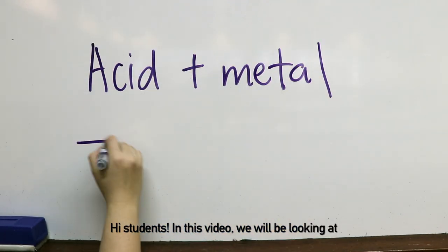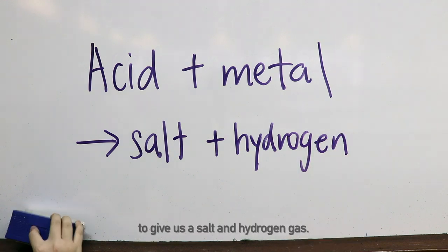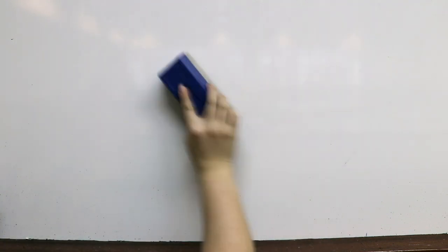Hi students! In this video, we will be looking at the reaction of an acid with a reactive metal to give us a salt and hydrogen gas.